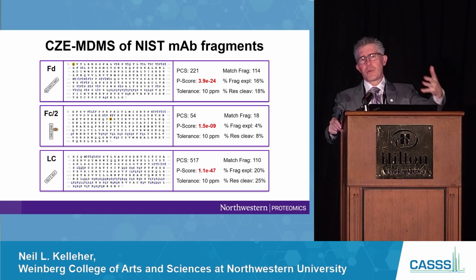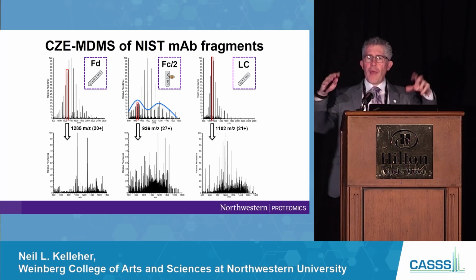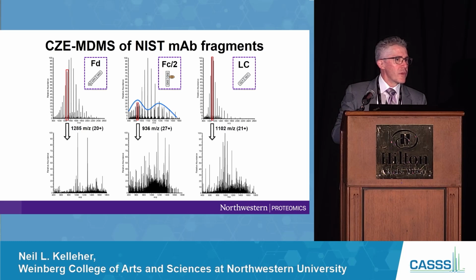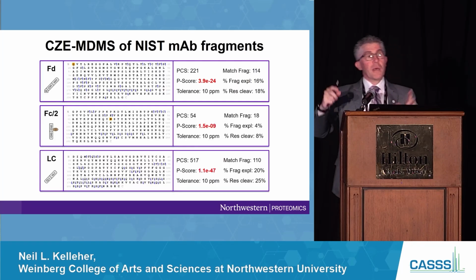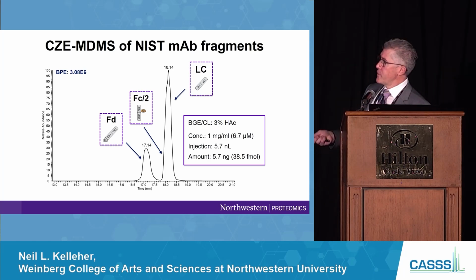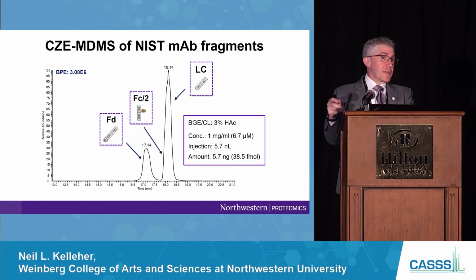Kevin was in the lab 2019 through 2022, and I think it's tunable. In terms of current speed, now there's the Ascend. They're always trying to make these things faster, but that development, at least at Thermo Fisher Scientific, is really geared around bottom-up, and the whole timsTOF speed race now at whatever, 150 hertz. But that speed has assisted this. And that's part of what I was saying: you can get 70, 80 on an LC combined with CZE, detuned CZE. You could get that sequence coverage today with commercial tools. That is not an overstatement, even with these sorts of peak widths. It is true that in all the different modes of capillary-based electrophoretic separations, you can get incredibly tight peak widths, and that can be too fast still.